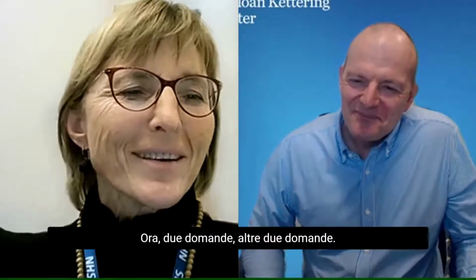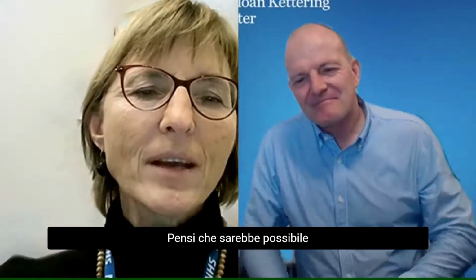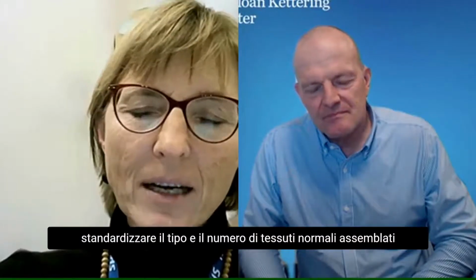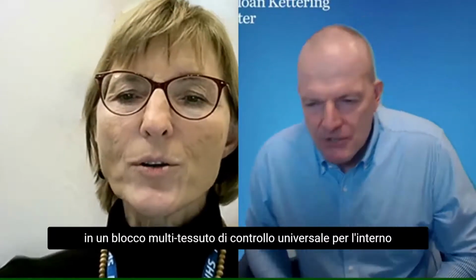So now two more questions. Do you think that it would be possible to standardize the kind and the number of normal tissues assembled in a universal control multi-tissue block for internal quality control of more than 80% of the antibodies normally used in a lab?